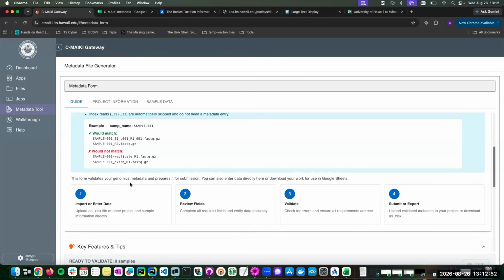I think my ultimate question is, is the pipeline unique to EMP? All we're doing is implementing pipelines that other people have written. And most of the pipelines do not care what primer you're using. They're generally reading after the primer. And I'm happy to show you a video and talk to you about it. But I've run these same pipelines on different sequencing facilities, different primers, different ways of building libraries, including both the EMP and Nextera, and they pretty much all work the same. And that's kind of how they're designed. So it should be fine.